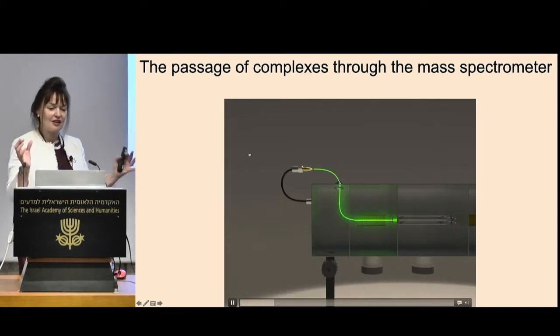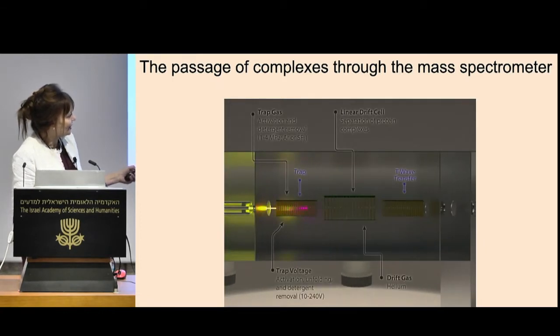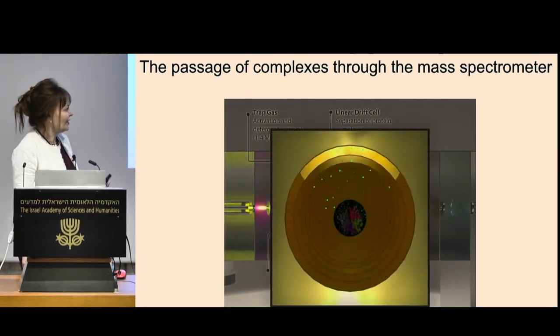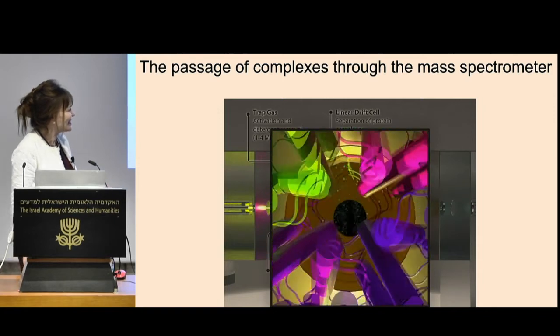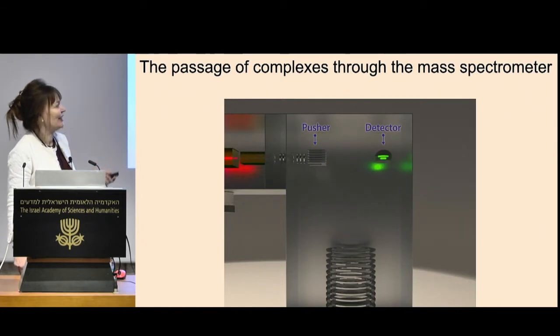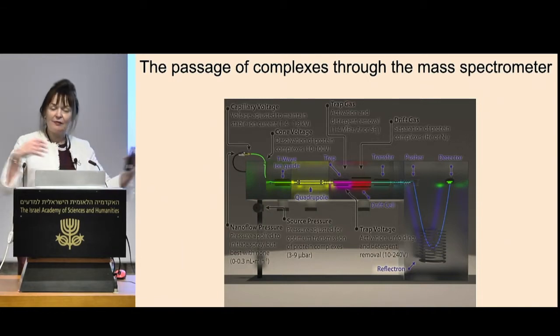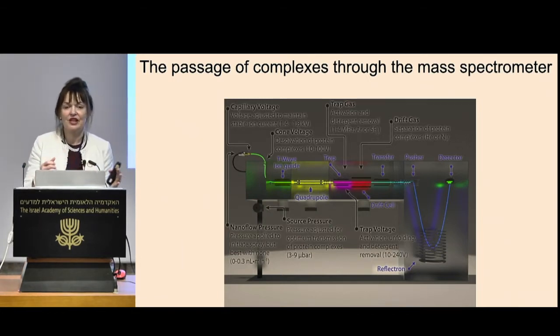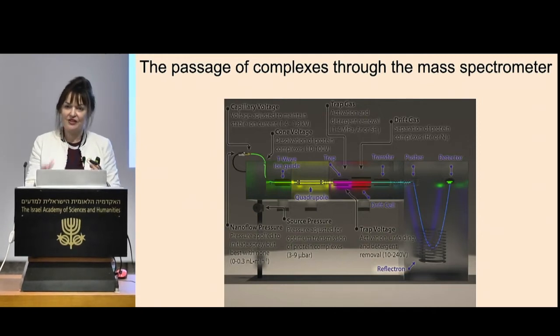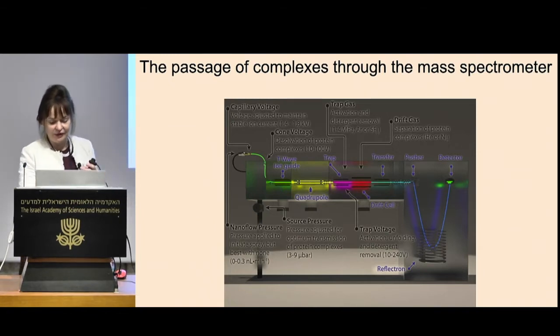So collision cross-section is a measure of something as it goes through here. You'll see that it gets buffeted because we've got a counter current of gas against it, tumbling away, artistic license, coming towards you, and then measured in the normal way in our time of flight. And if you look at this region here, this is the part that can separate molecules according to shape. So, of course, you have mass to charge, that's one property, but folded and unfolded have the same mass to charge but different shapes. So we could now add a new dimension to our measurements.